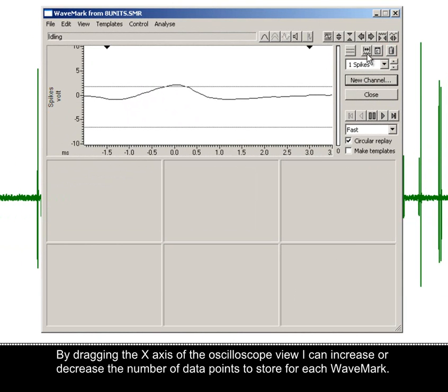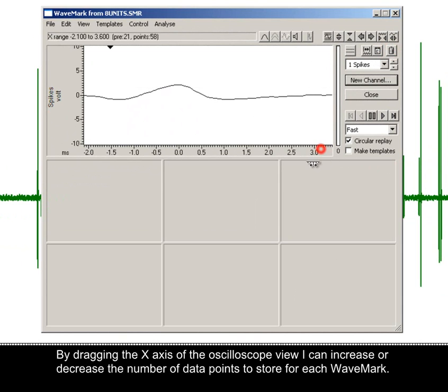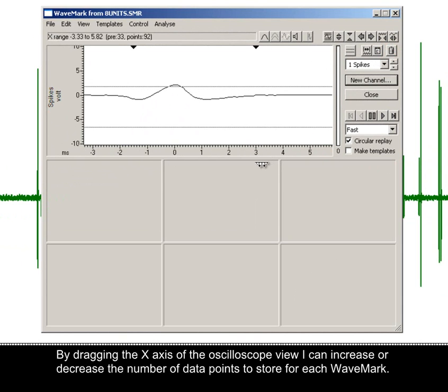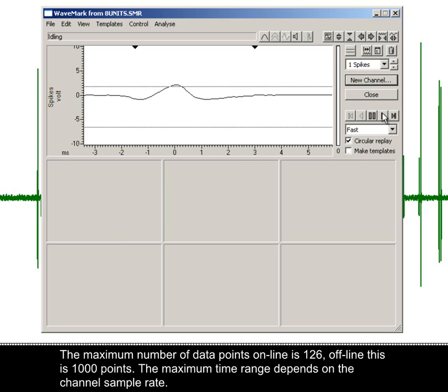By dragging the x-axis of the oscilloscope view, I can increase or decrease the number of data points to store for each wave mark. The maximum number of data points online is 126; offline this is 1000 points. The maximum time range depends on the channel sample rate.